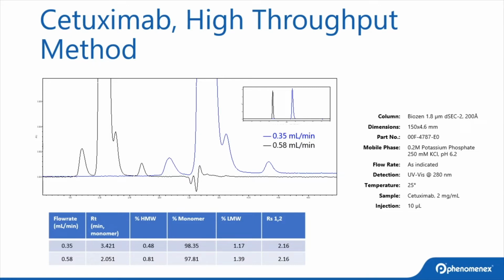Interestingly, the HMW is overreported, with the resolution of lower molecular weight fragment actually improving. This may simply be because smaller fragments are less impacted by flow rates since they have a more favorable diffusion rate. Nevertheless, this will not be quite as quantitative a measure, nor will one expect this methodology to be repeatable. That is, I imagine that with the higher flow rate methods, peak areas and integration might vary more, as the stochastic nature of SEC will be much more pronounced with that higher linear velocity.